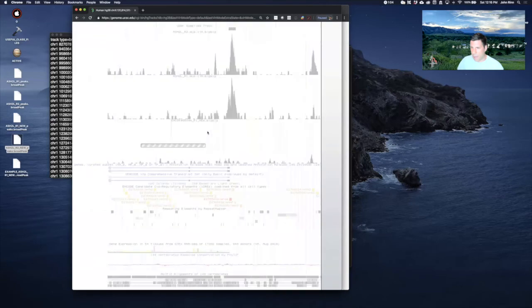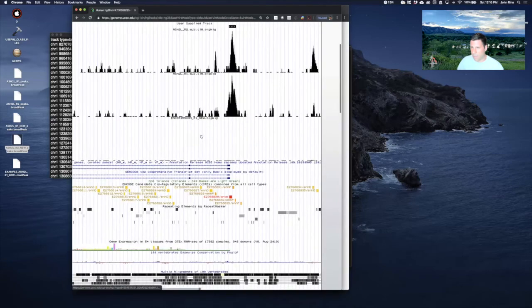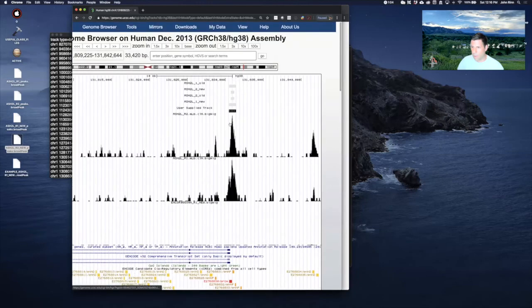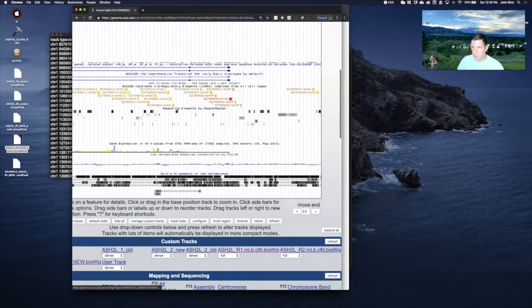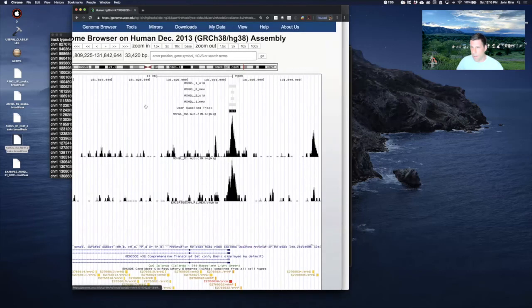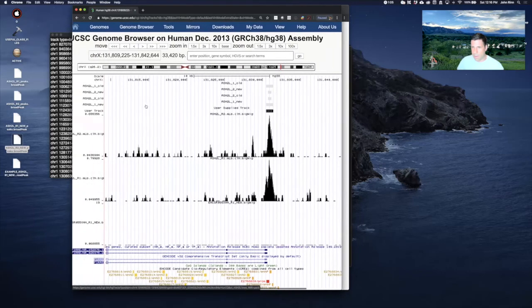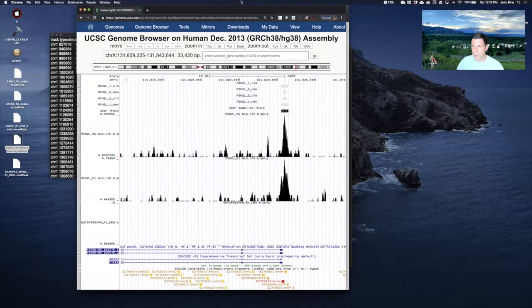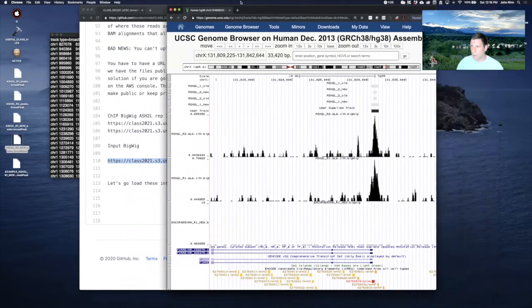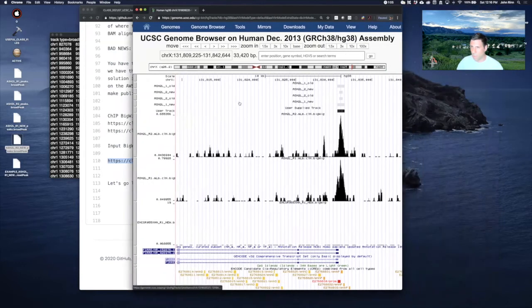We now have this lined up with all of that information. It's repeat maskers. There's a promoter, right, where there's supposed to be a promoter. This all makes sense. You can look at the expression, add in that RNA-seq track if we wanted to. But those were the main concepts. UCSC is great because you're gonna have so much data at your hands, but you're gonna have to think a little bit about what UCSC wants and its formatting.